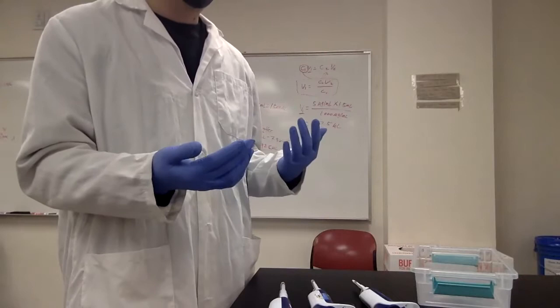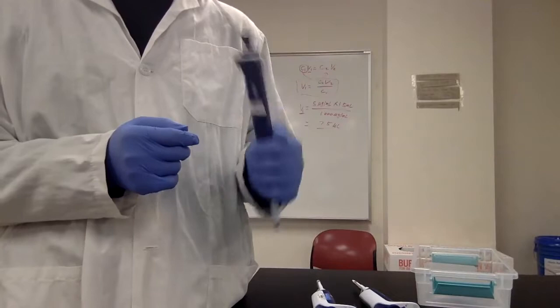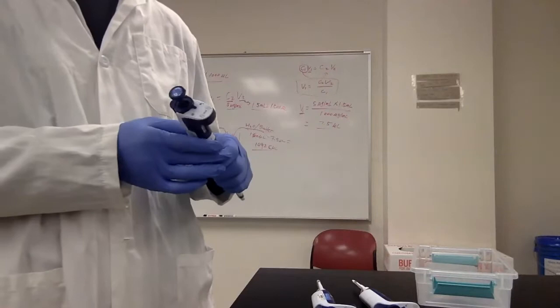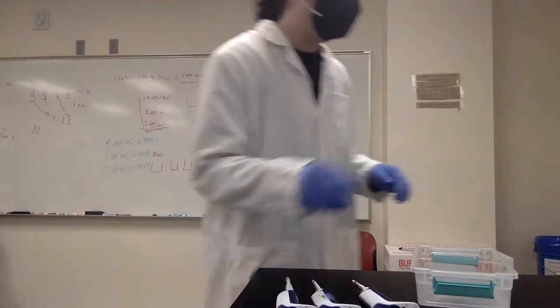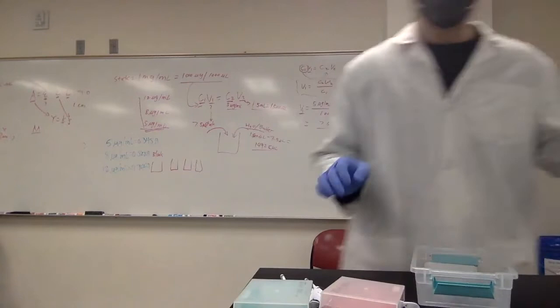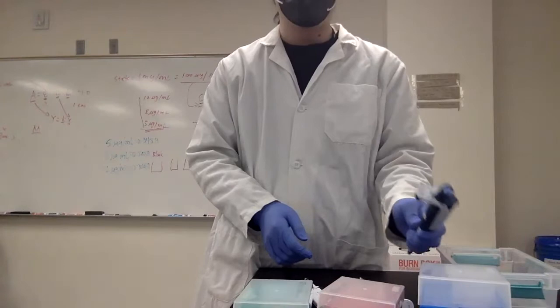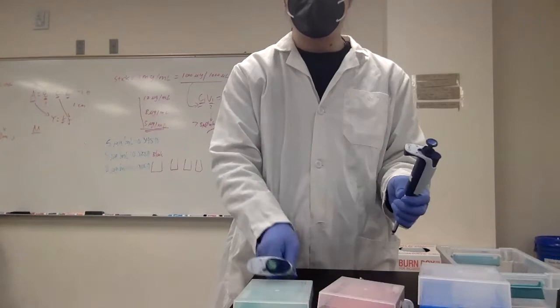Okay. After you adjust the pipette to the correct volume, the next step is how to transfer the liquid. You need one more thing, which is pipette tips. Since we have three different types of pipettes, obviously we will have three different types of pipette tips. The blue one matches L1000, the green one matches L200, and the red one matches L20.